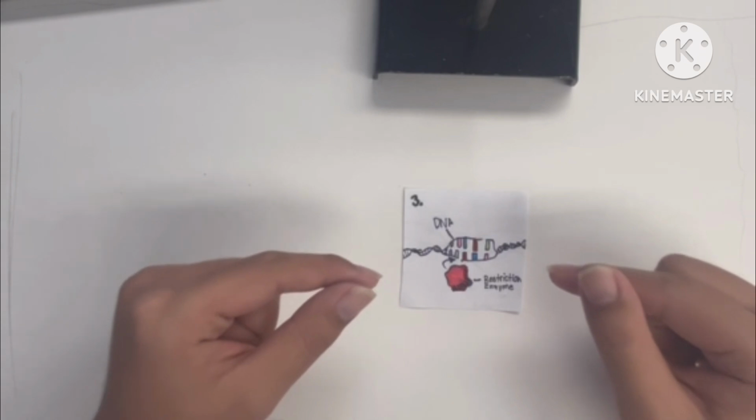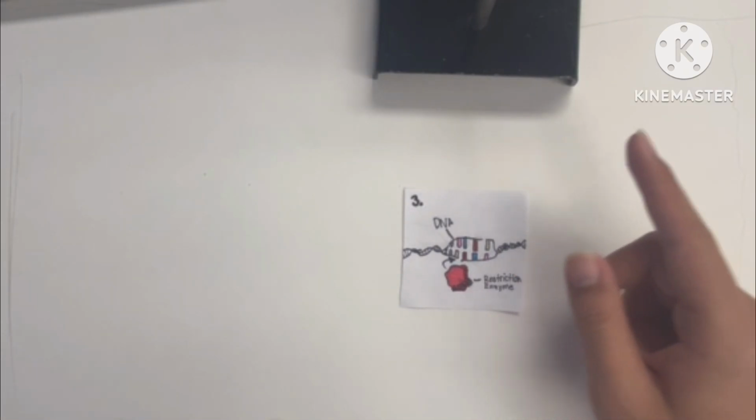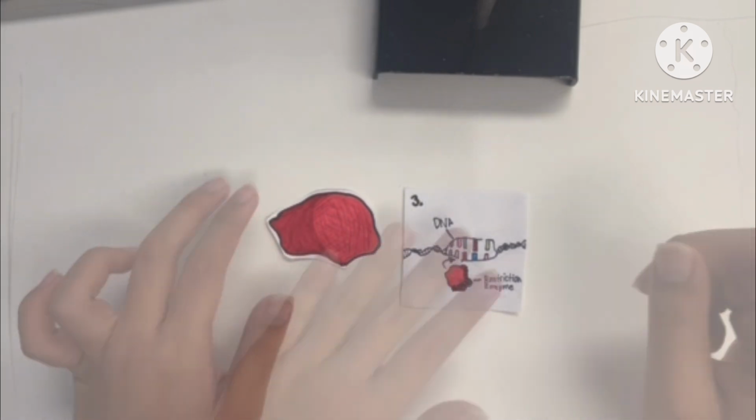Now the third step is to cut the DNA strands. Then these cut strands will be used for gel electrophoresis. Using restriction enzymes, DNA is cut at a specific nucleotide sequence.